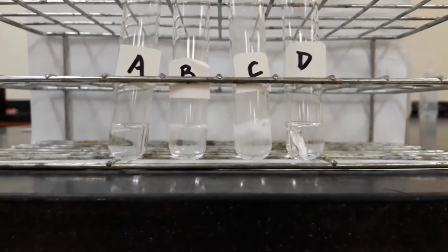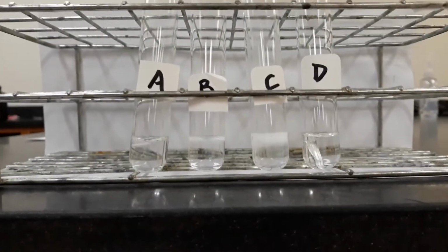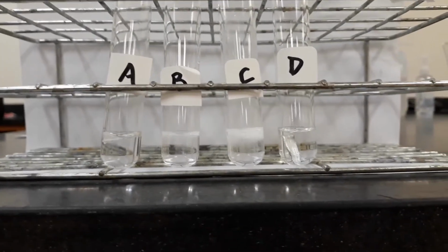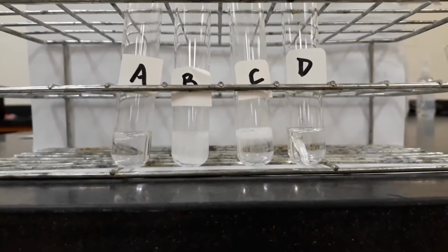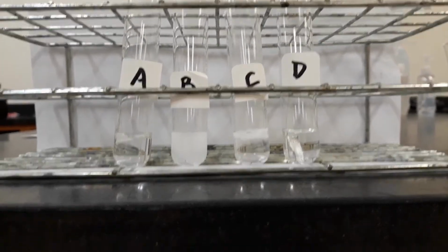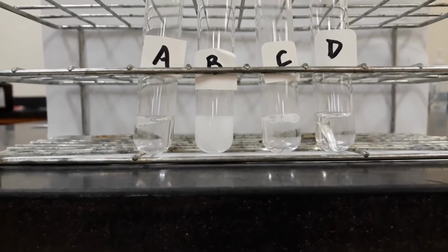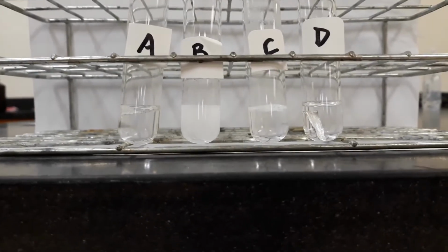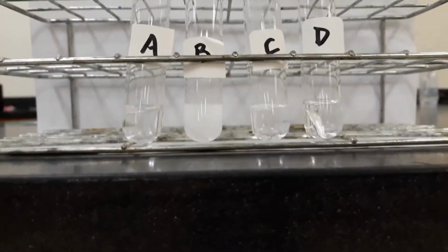A, maybe very slowly, but I think that's just bubbles in the water. B is reacting fairly quickly, C violently, and D, again, I think those are just bubbles collecting from the water. So A and D not, and B rapidly, but C violently.